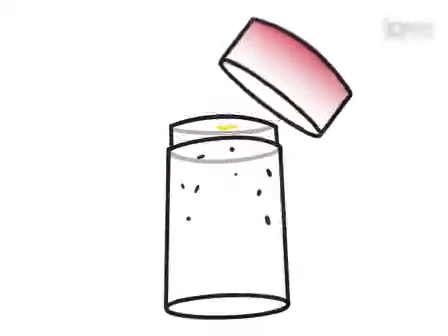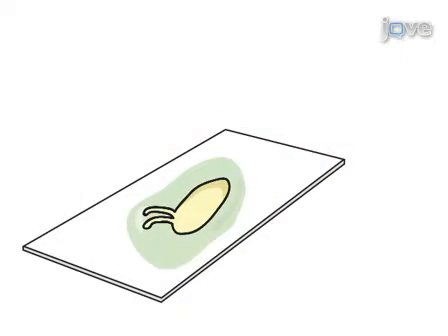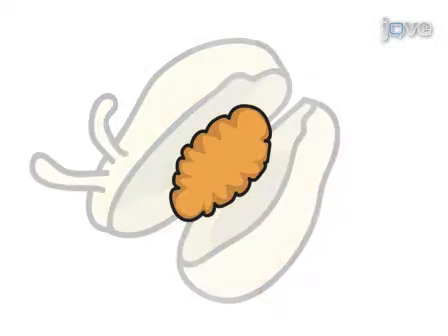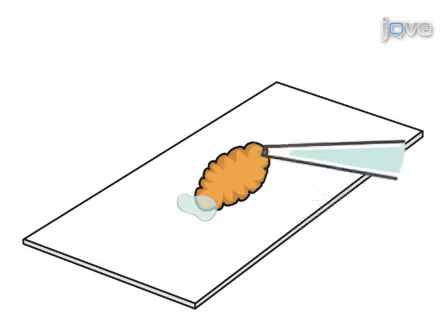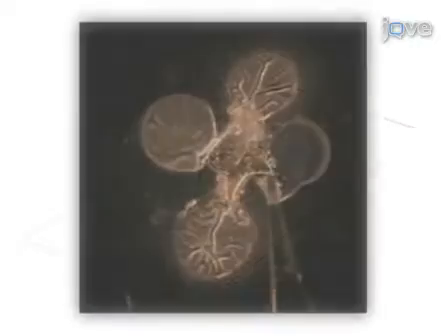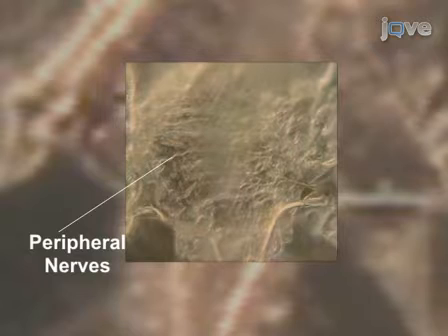To perform electrophysiological recordings in Drosophila embryos, they must first be harvested, decorinated, and dissected. Controlled dissection is made possible with water-polymerizing surgical glue, which stabilizes the embryos to coverslips. The internal organs are then removed from stabilized embryos to expose the ventral CNS, the peripheral nerves, and the somatic musculature.